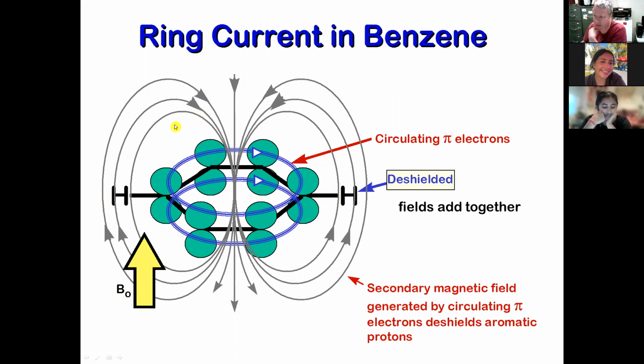It has like 14 carbons, a huge, big aromatic ring with protons in the middle. Where are those going to be shielded or deshielded? Imagine a big benzene with protons in the middle. They're going to be shielded, so shielded that they're like -3 ppm. They're off the scale because it's such a weird thing. You can Google it if you want.